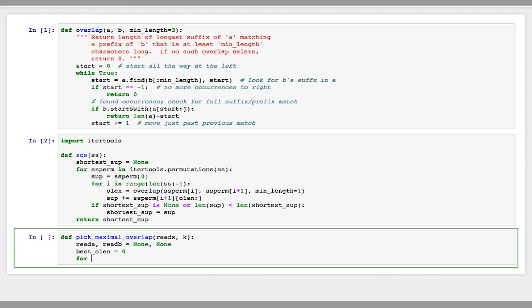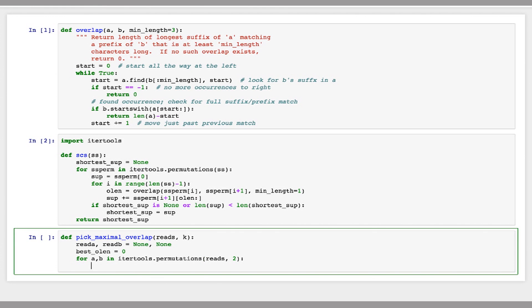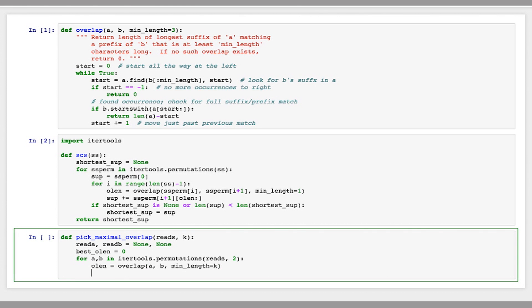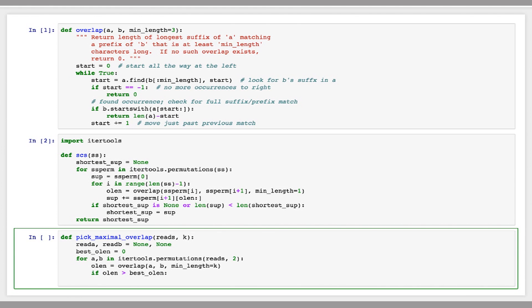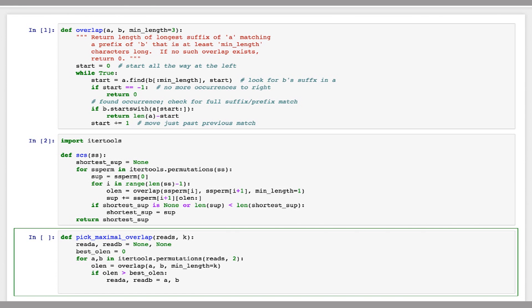And I'll say for each pair of reads a and b in itertools.permutations 2. So I'm going to take pairs of reads. So for every pair of reads, I'm going to calculate the overlap length. And then if this overlap length is larger than the best overlap length that we've seen so far, store these reads as our best ones that we've found. So I'll say if overlap length is greater than best overlap length, best overlap length equals overlap length.